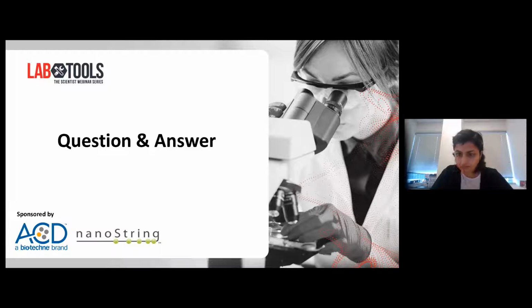So we have the basic populations, and of course, like I said before, if you have specific populations of neurons or microglia that you're working with that you want to define yourself, you can use those, or you can use our preset ones. You can find it through our website by going to our GeoMx tools page and navigating to the GitHub repositories.